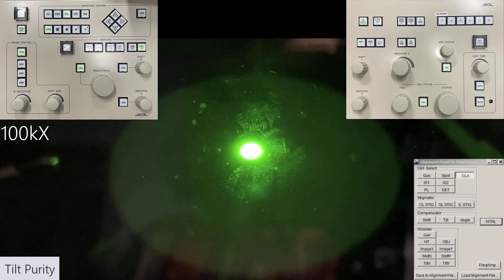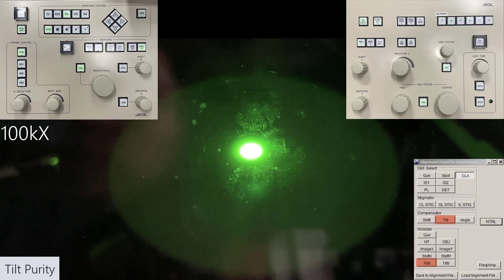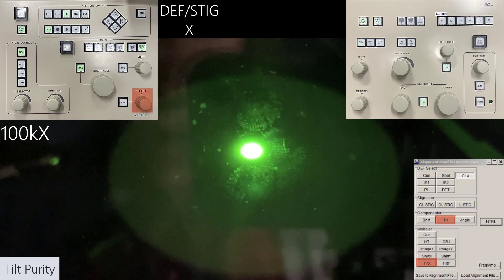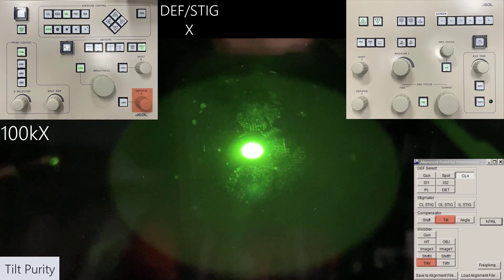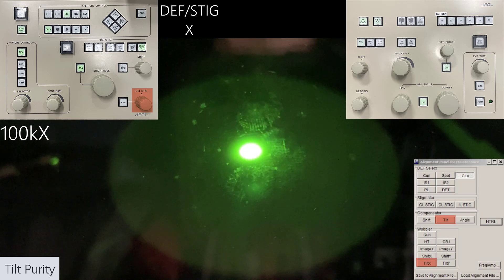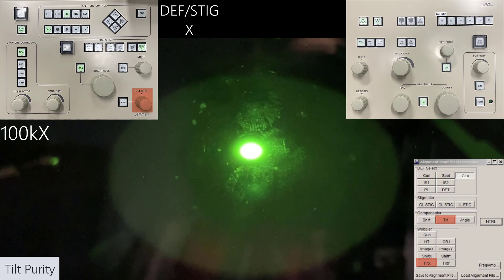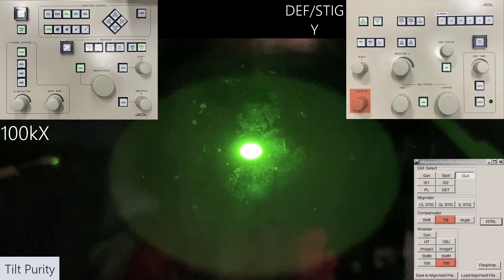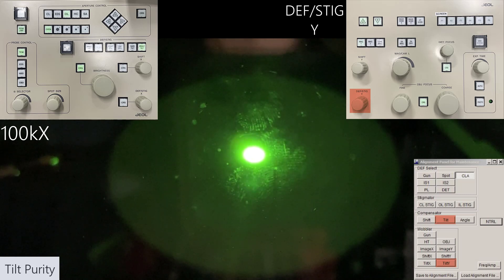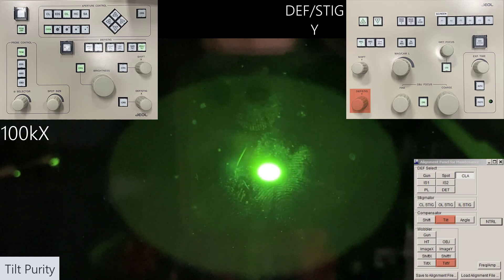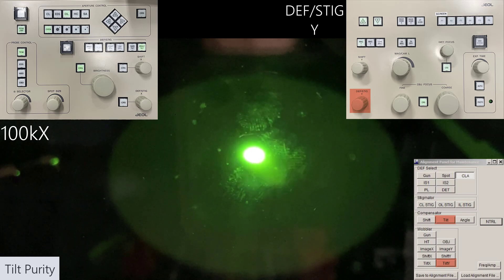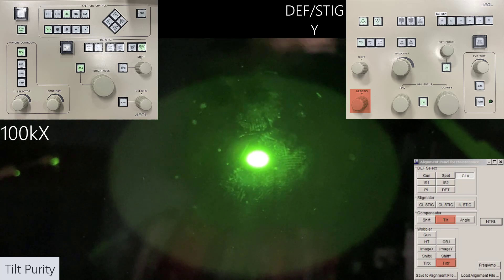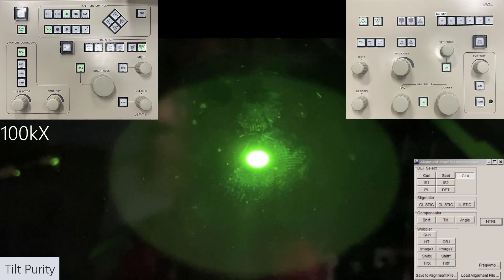Moving on to tilt purity. Use the compensator tilt button in the alignment panel, then select tilt X under wobbler. Use the deflector stigmator X knob to minimize the wobbling. Once done, deselect tilt X and select tilt Y — this time use the deflector stigmator Y knob to minimize the wobbling. When finished, deselect tilt Y and deselect the tilt button under compensator.